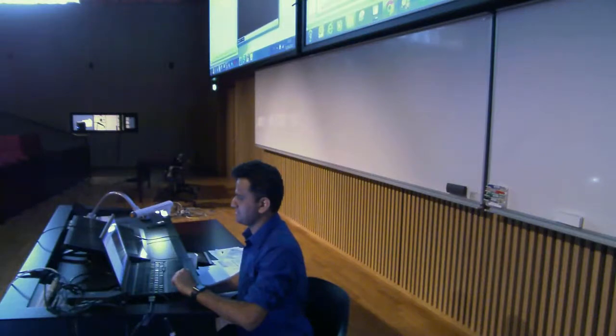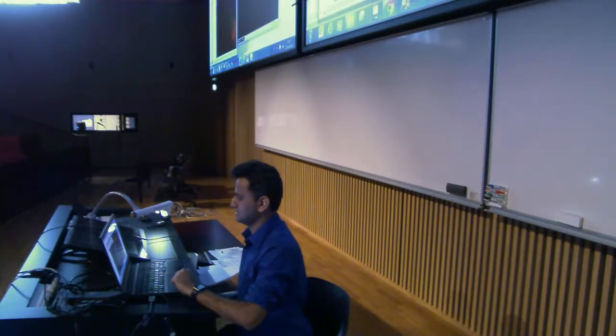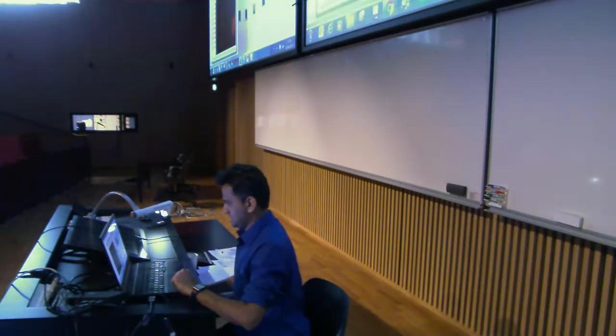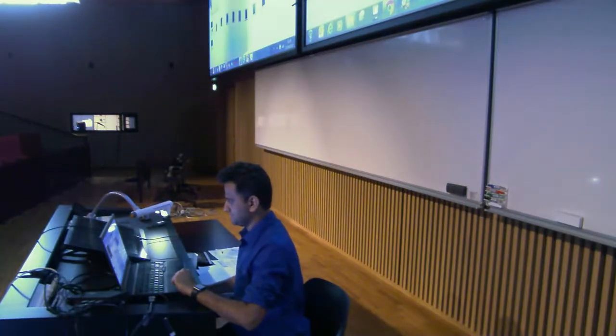Okay. So this is the movie which was calculated. You see, this is a movie. The reason why it was clipped is because it has to be on the full view mode, okay? Because we actually cropped it. But it is possible to actually have the animation in FIJI. And also you can view and visualize the data.